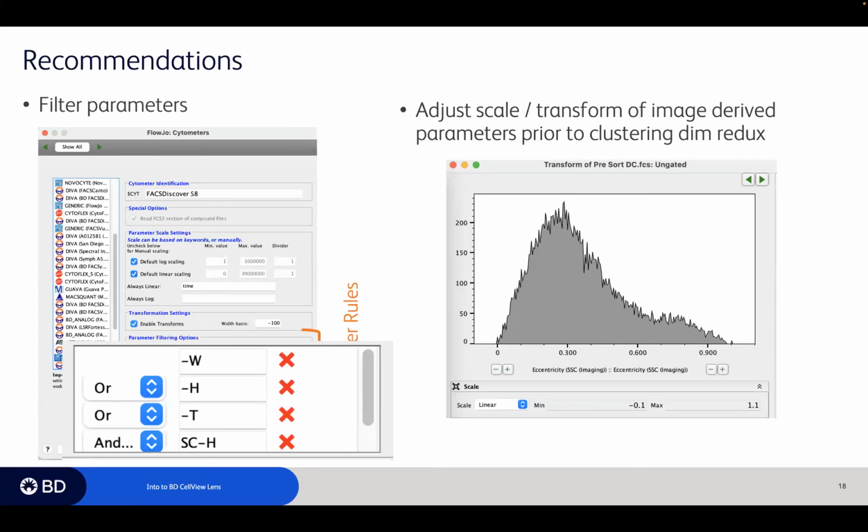So if you've got, in this little simple example here, two peaks, a smaller one and a big one, the things that are all in this big peak you'd like to see go together in clustering or dimensionality reduction, and things in the little one maybe get together. And you're letting the algorithm know that these are considered fairly different because you push them all the way to the edges of your data space and didn't leave a whole bunch of white space. If we did have white space and we smashed all of the info into a very small bit of our data range, then you would be telling the algorithms that they're all pretty similar.